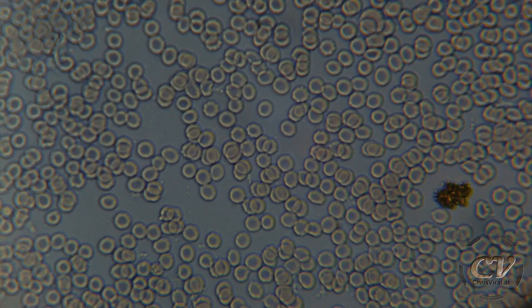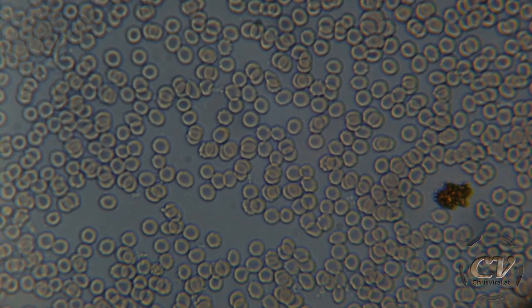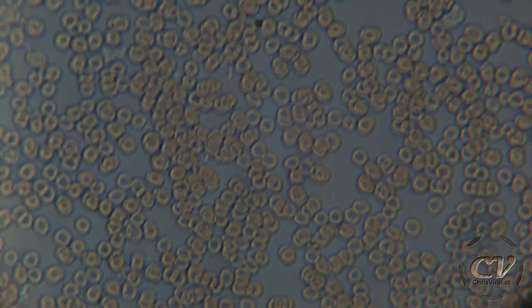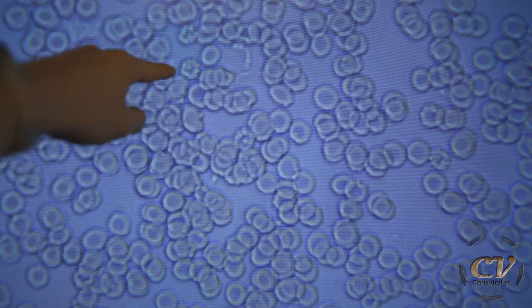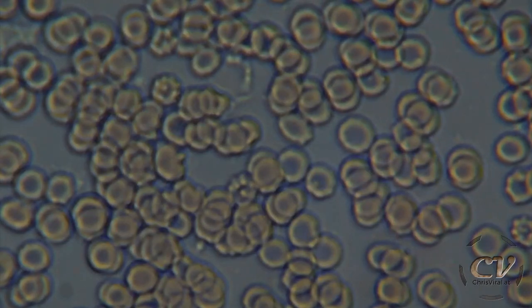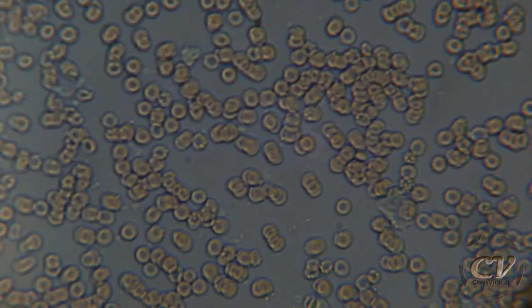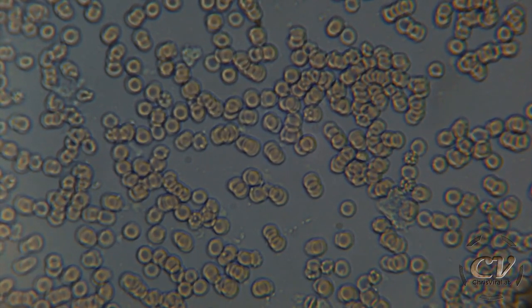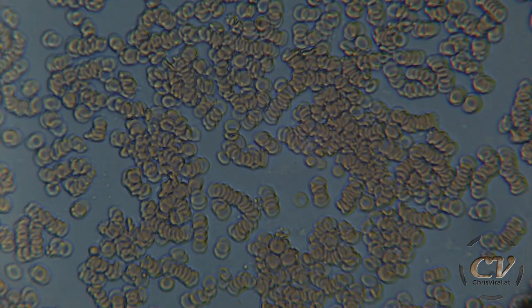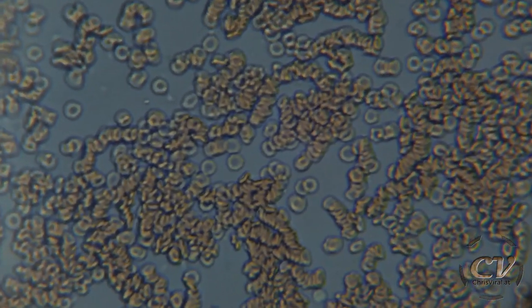What? What the hell is this? It's not looking right. Was that in my blood? These little cells with spikes — like this one right here. These are clearly antibodies, I think. As always — is this the right focus or is this the right focus? It's so hard to say. They look kind of dried up, but they're still moving actually. These are the edges of the sample by the way — maybe I'm able to actually find the edge.